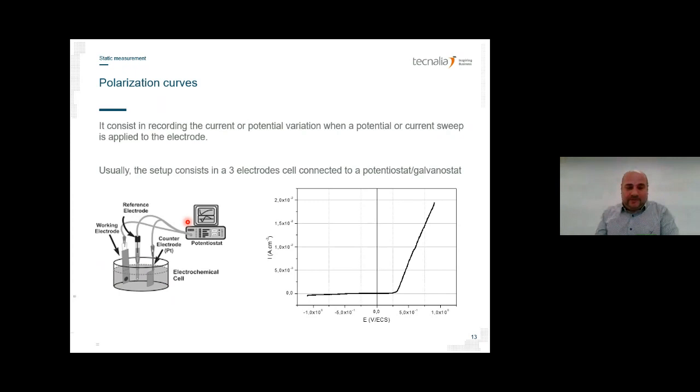And if there is a gas reaction, for example the reduction of the proton into hydrogen or electrolysis of the water, we need to catalyze this reaction so as not to be limited by it. That makes platinum a very good material for a counter electrode. The point is platinum is very expensive. So it works well in the laboratory for exploratory measurements. But sometimes cheaper counter electrodes are as efficient when we know that we don't have gas evolution, or limited gas evolution. We can use a graphite counter electrode that has a very high surface area compared to the sample, and that works very well also.